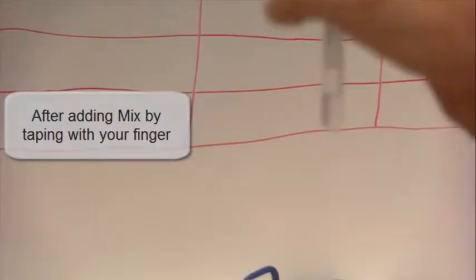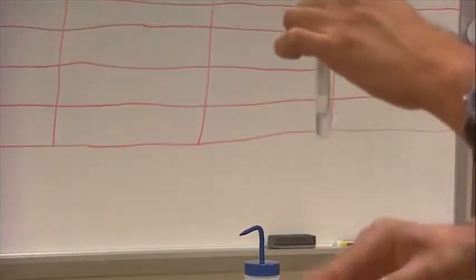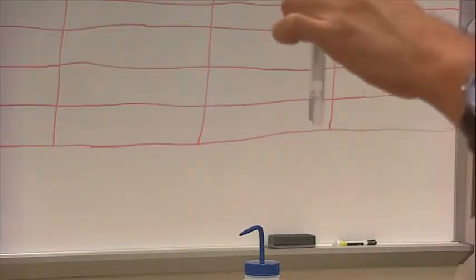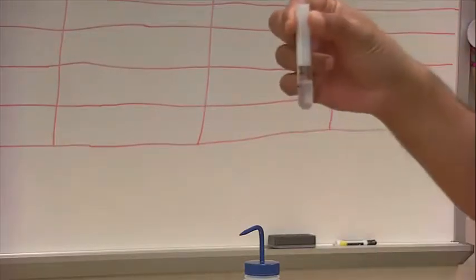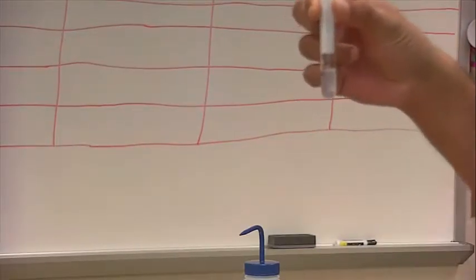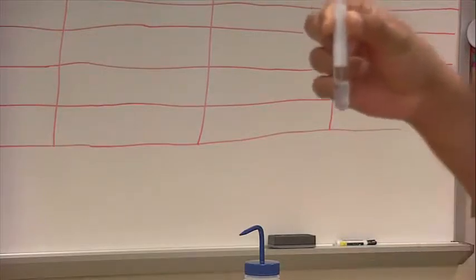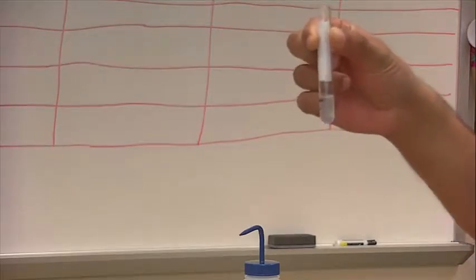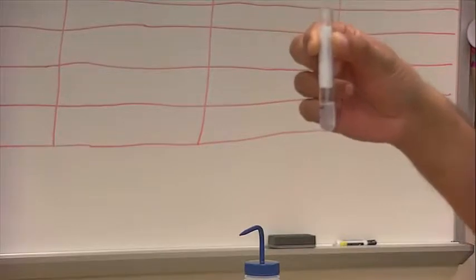If it's turbid, if it's cloudy, if it's jelly, if the solution has any type of characteristics visually. In this case, you want to be as descriptive as possible in describing your precipitate, whether it's there or not, whether some of it is there, whether some of it has dissolved. So here in this particular lab, description, qualitative observations that you note down in your data table and your notebook are going to be very important.